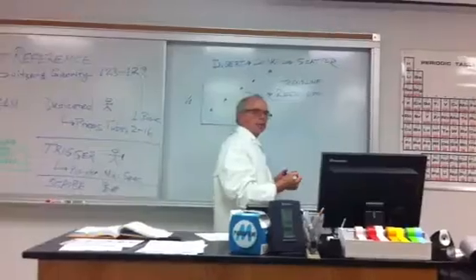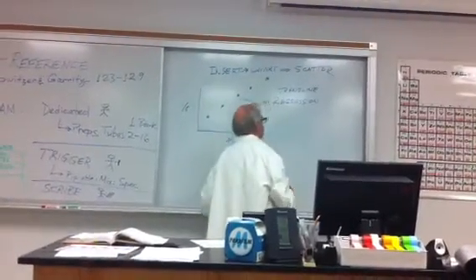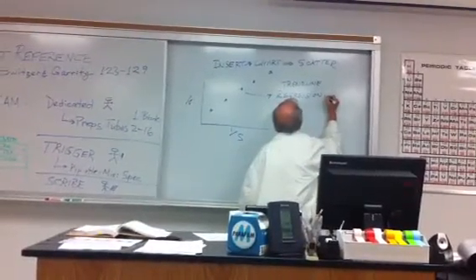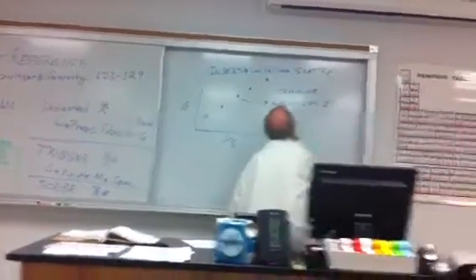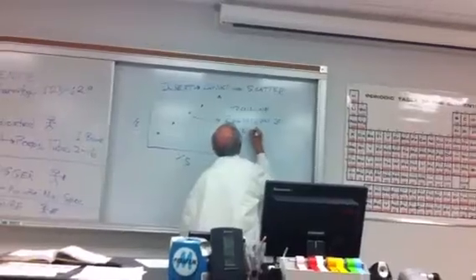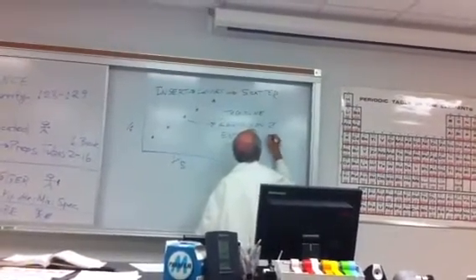It says extend back. So in other words, while you click on that, say regression, yes, you also want to extend it backwards. Extend, I'm not sure what the word is, and you say negative, and so it says, well, how much?